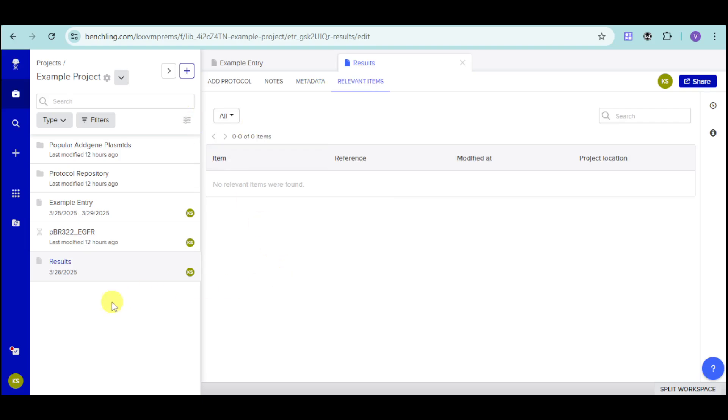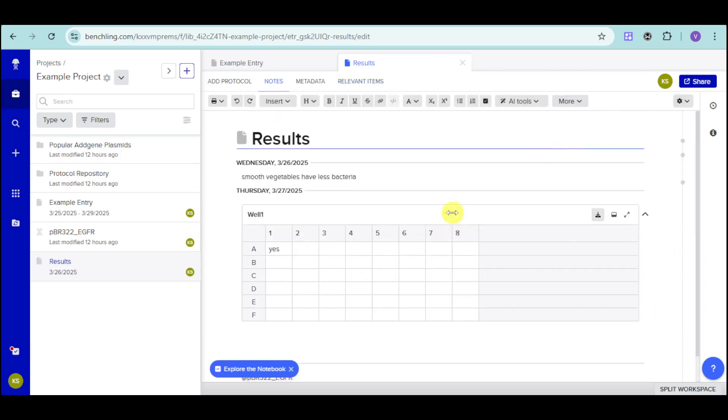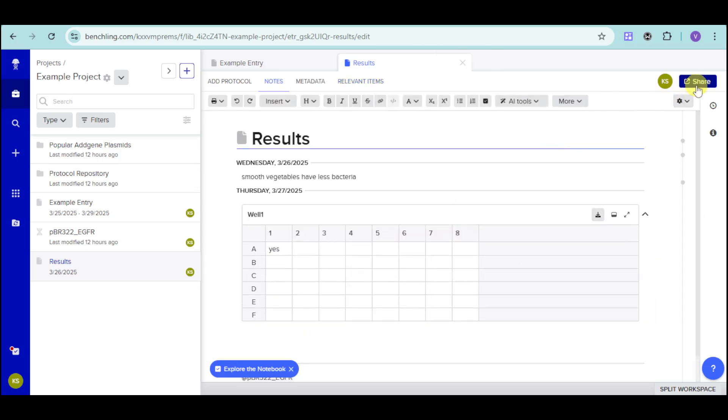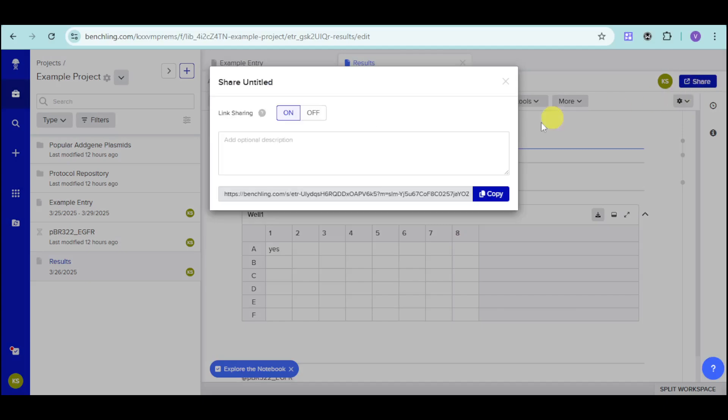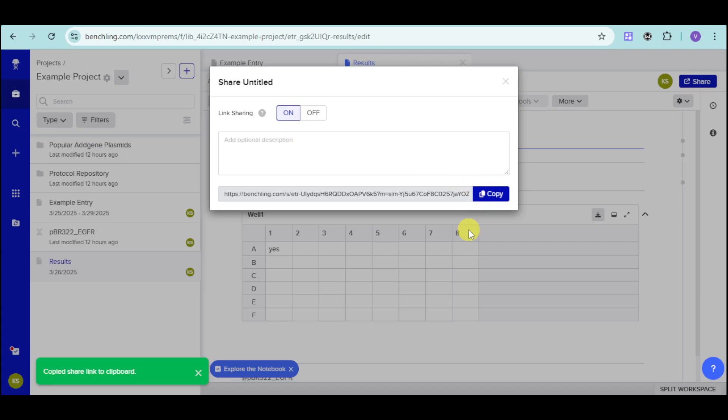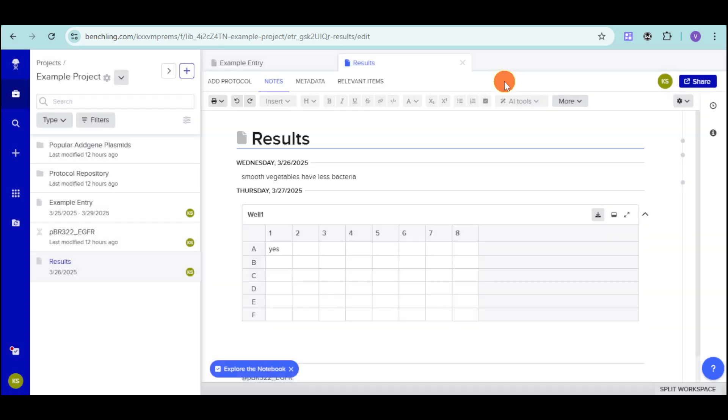If you want to actually share the notes that you want or that you have created, you can click onto this share option right here. And then, you can just turn on the link sharing as well as the description for that. Click on copy right here. And then, you can send it to a messaging platform in order to share it to people. As of right now, they don't have the people sharing function yet, but they already have the link sharing function. You can share it via the link.